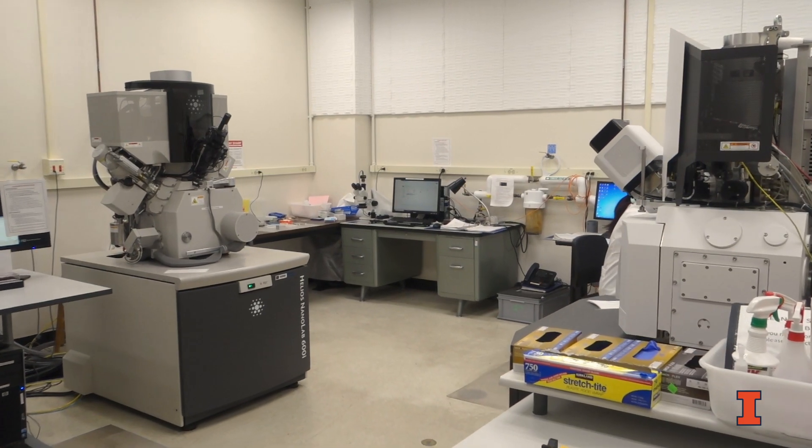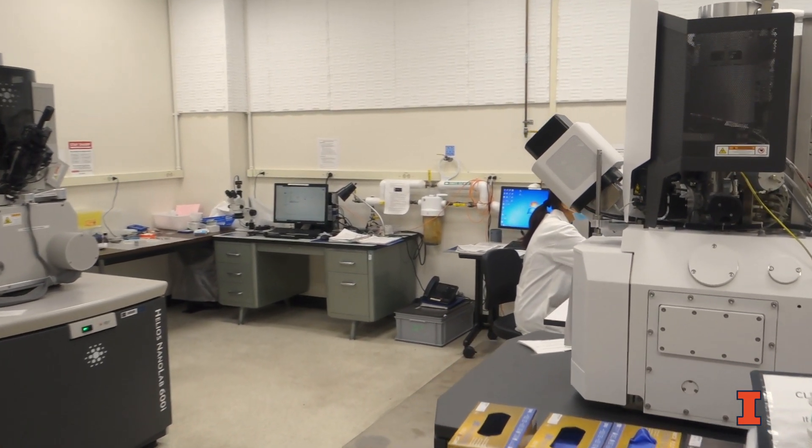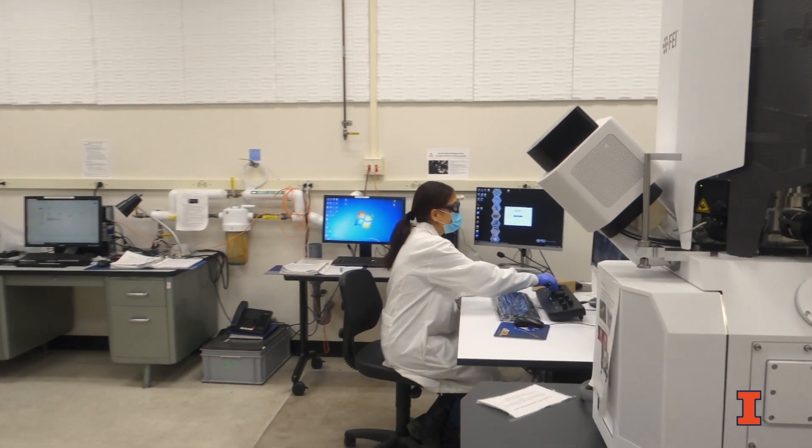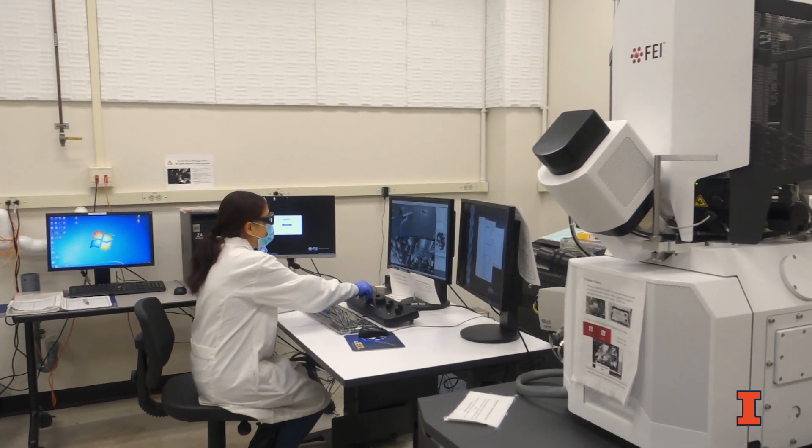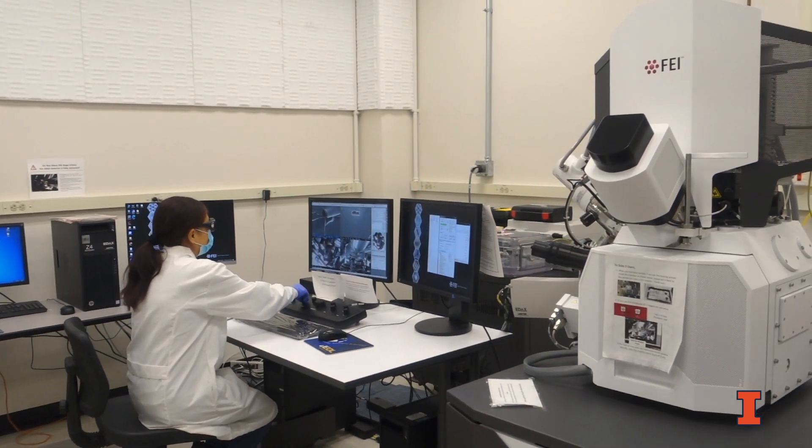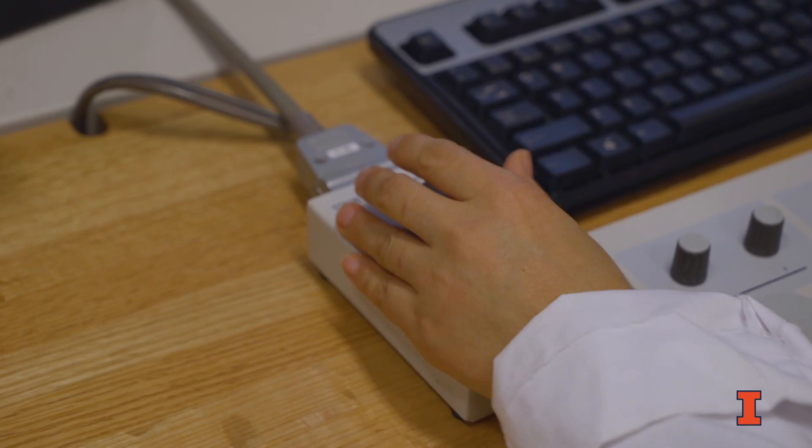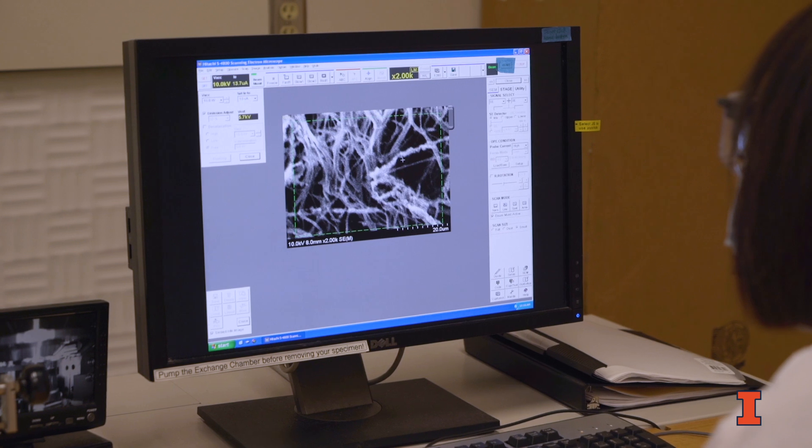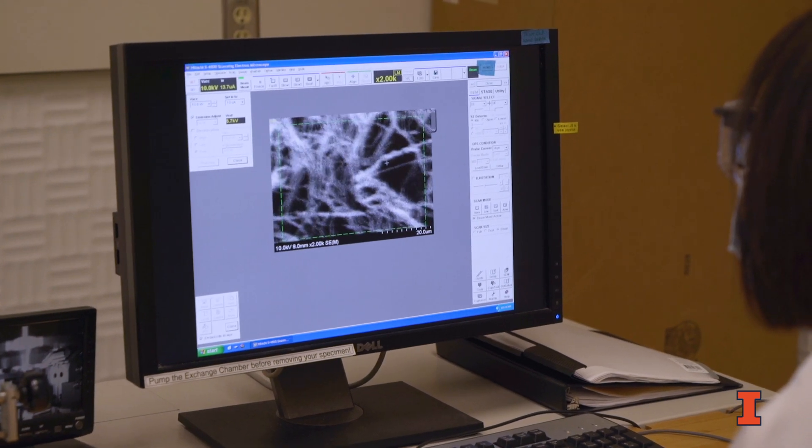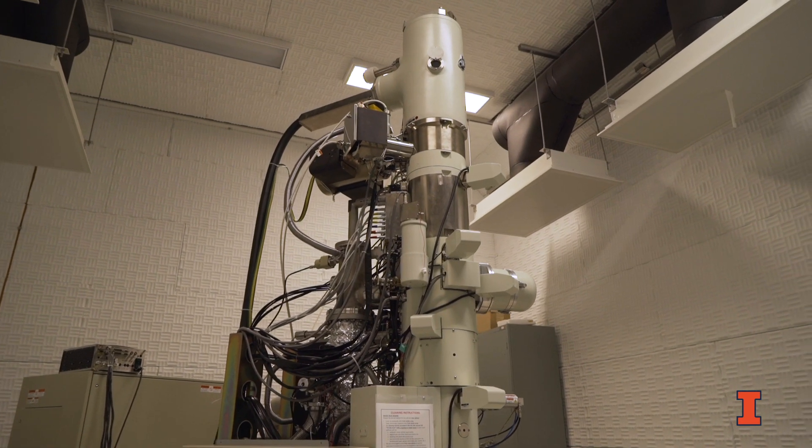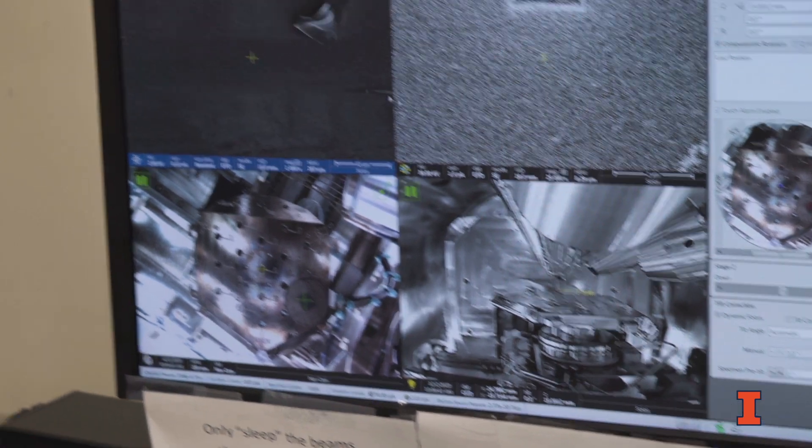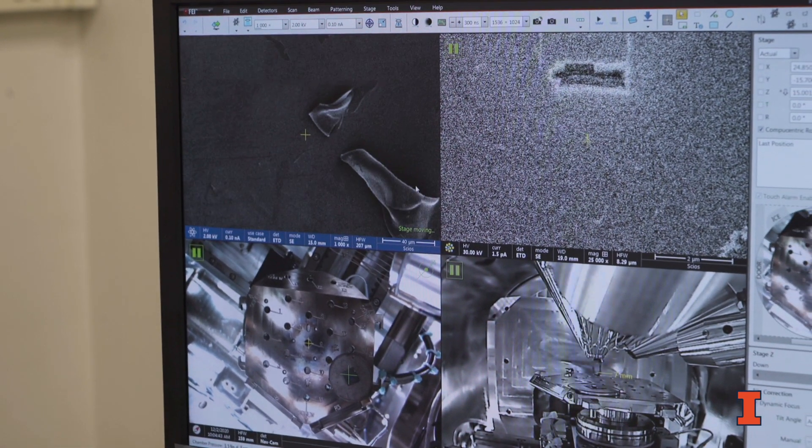Two dual-beam focused ion beam systems, the Scios 2 and Helios 600, are available for 3D materials processing and automated lift-out, in addition to four scanning electron microscopes with EDS, electron backscattering diffraction, and cathode luminescence capabilities. We also offer a multitude of tools for sample preparation, including a PECS II ion beam polisher.